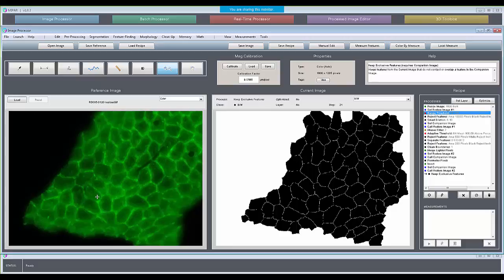The goodness of the recipe, yes, fantastic question. Nothing as clear-cut as that, Leslie. As we've shown, the optimization can be used to assess the goodness of a given step. As far as a sensitivity analysis, that's not automated right now, but it would be nice if you could vary one step and plot the resulting area fraction. If you've got a ground truth of some kind that you're comparing the result of a recipe against, and your ground truth gives one area fraction and your recipe gives another, then the disparity between those could tell you the goodness of the recipe.